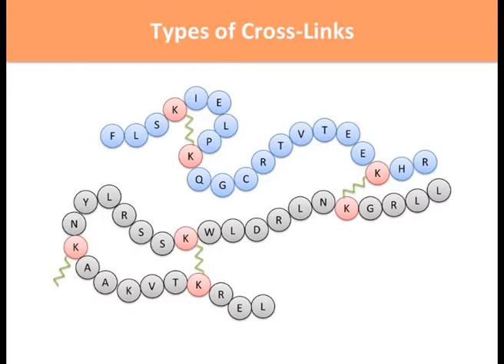So in cases where a cross-linker attaches to a lysine and there is nothing for it to attach to on the other end, this will just hydrolyze and become inert, and no bond is formed. And then there are other cases, such as this lysine here, that perhaps because it is tucked into a pocket in the entire protein complex, the cross-linker is not capable of reaching it, and so it'll remain uncross-linked.